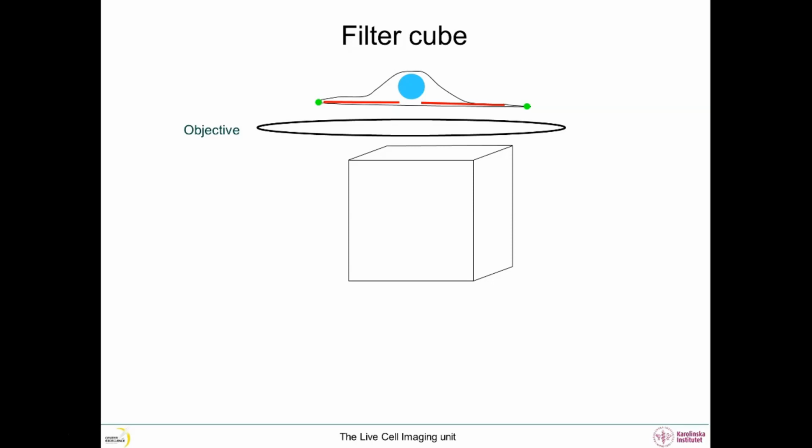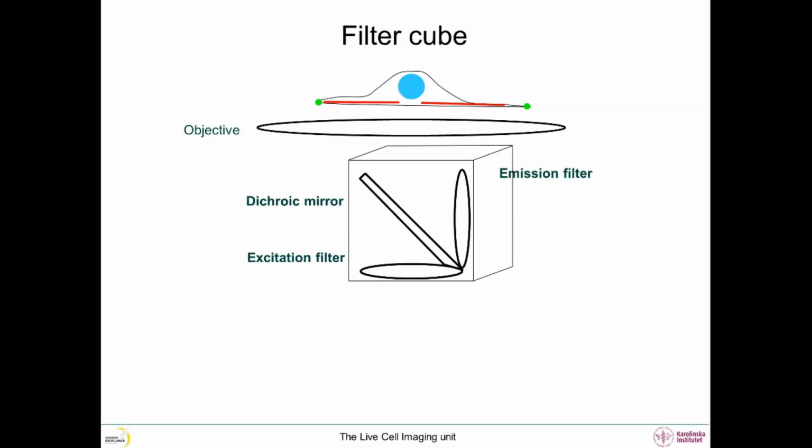When imaging a sample with multiple labels, we use filters to discriminate the fluorophores. On wide field systems, these filters are often organized as a set in a filter cube. A filter cube contains a set of 3 filters: an excitation filter, a dichroic mirror, and an emission filter.